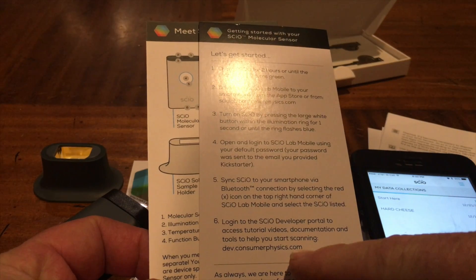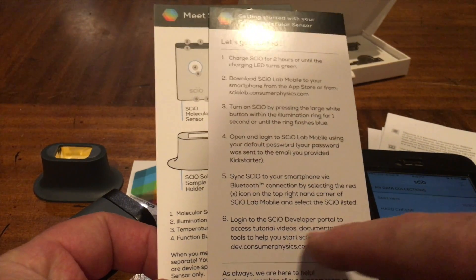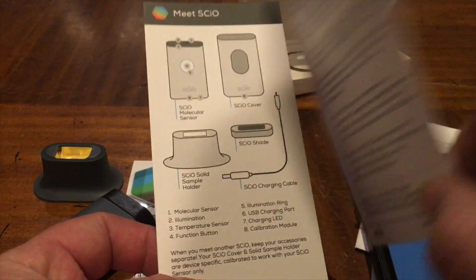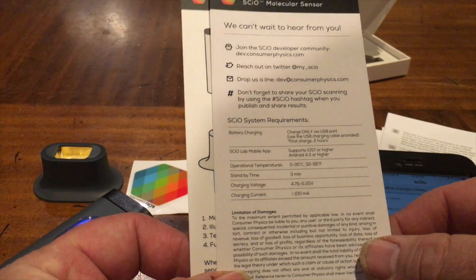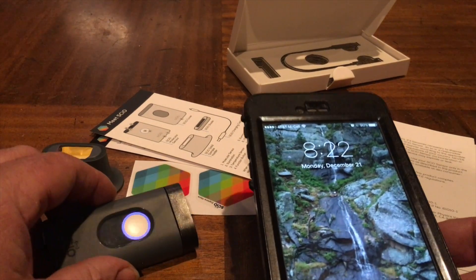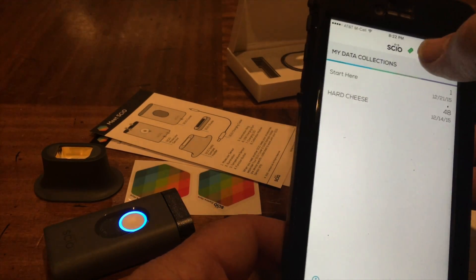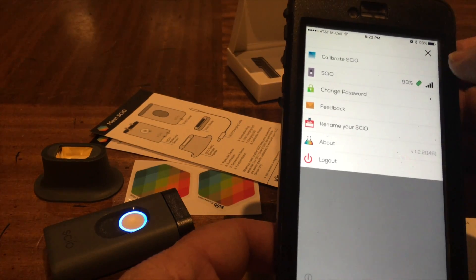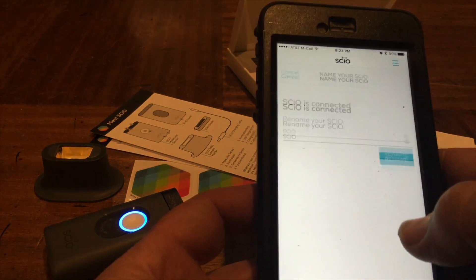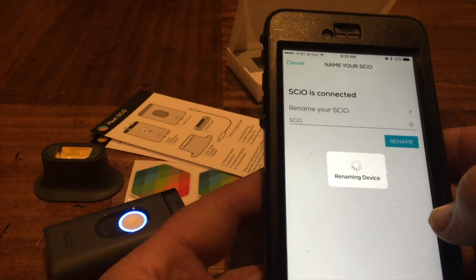Sync, login - oh yep, developer portal to access tutorial videos. I should have watched those before - I didn't see this, I didn't know about them. Now I do, so I'll go watch those. It went into battery save mode maybe because the app quit. It's connected here - 93% battery, truly paired with Sayo.